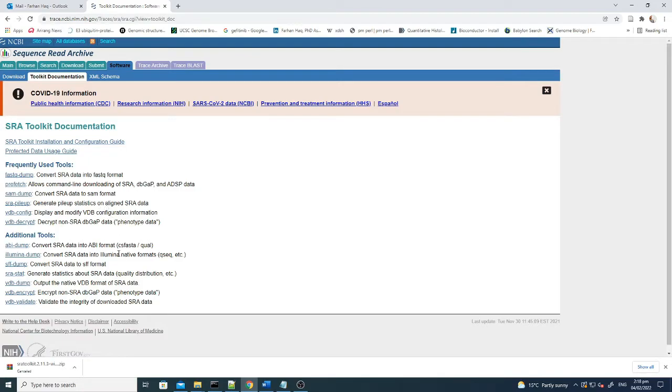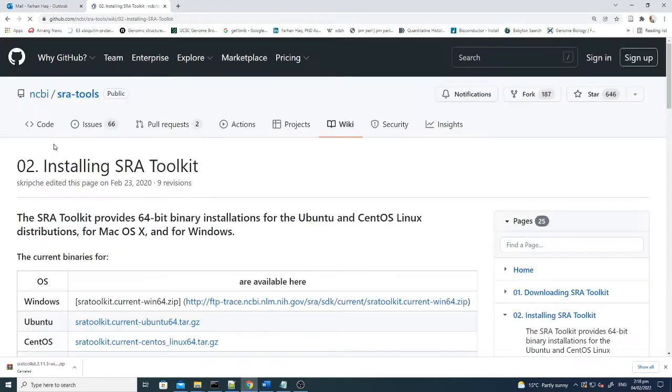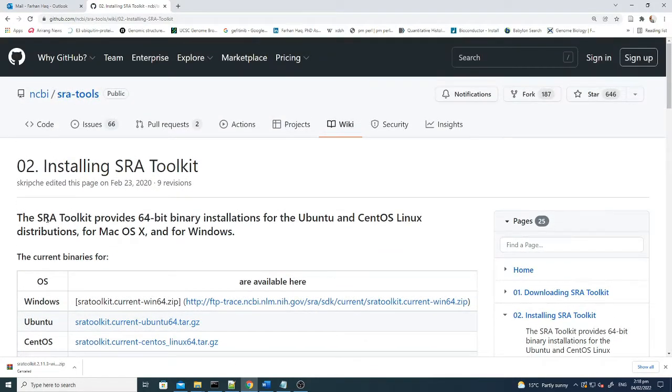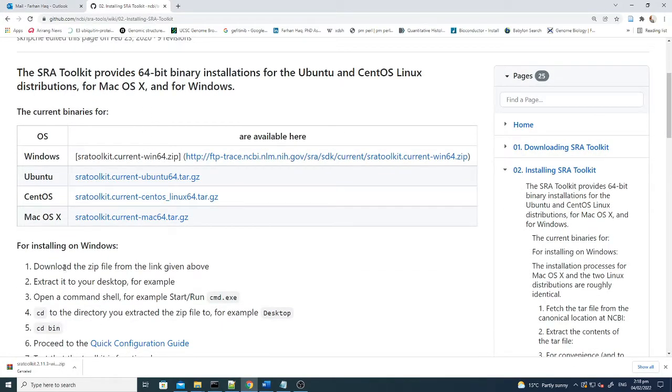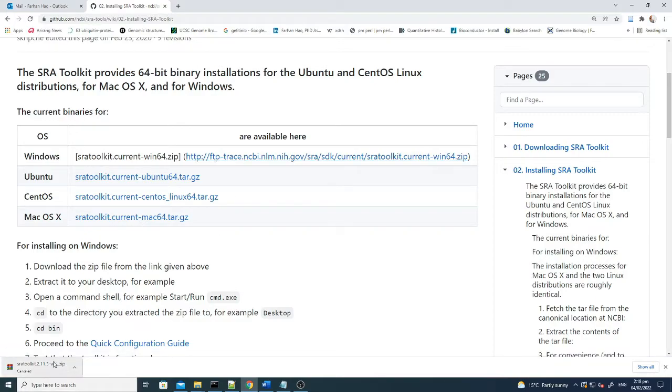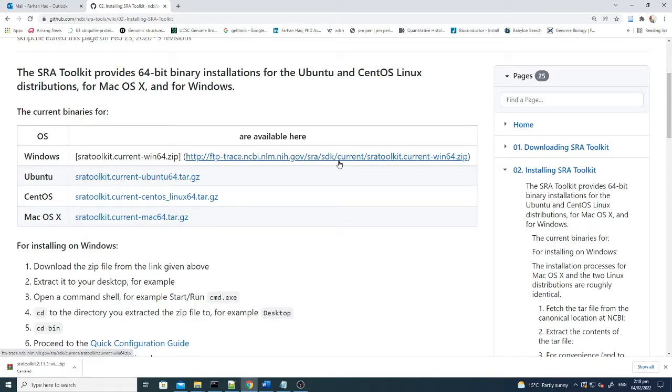The first step is to download this. You can go to the SRA toolkit installation guide. From here you can download it for Windows, Ubuntu, CentOS, and Mac operating systems. For Windows you just need to click this one and it will start. When you click it, it will be downloaded as a zip file.